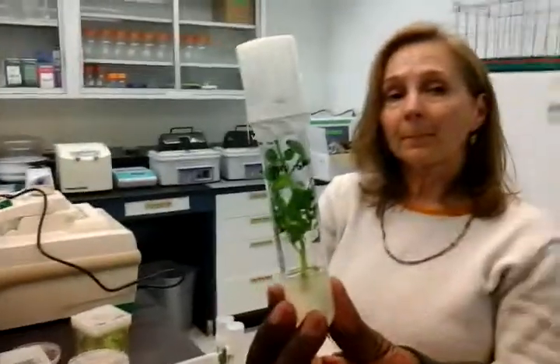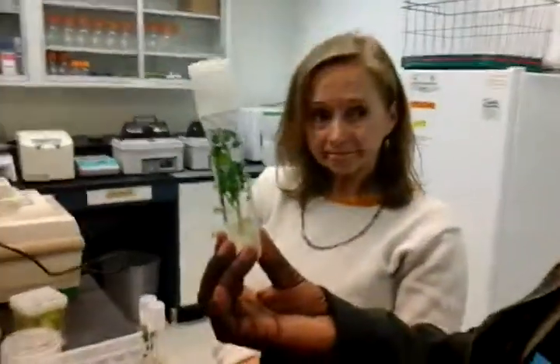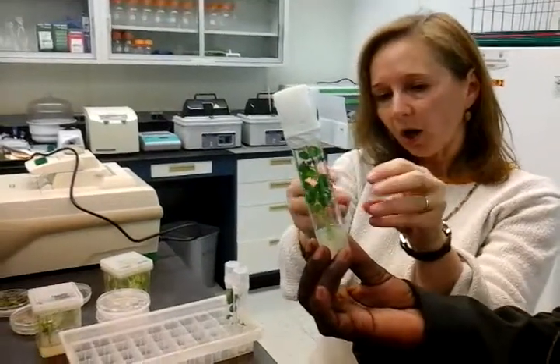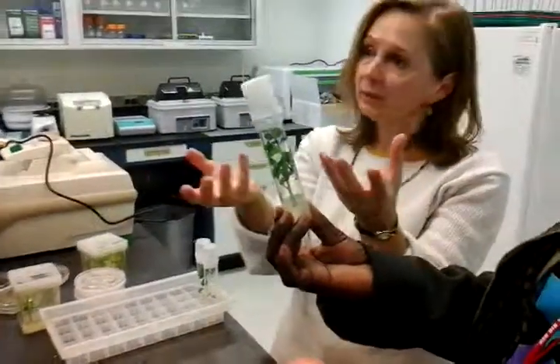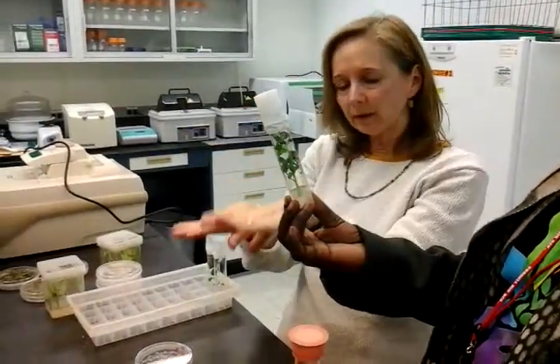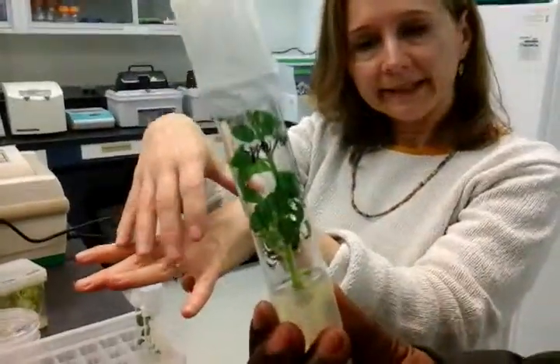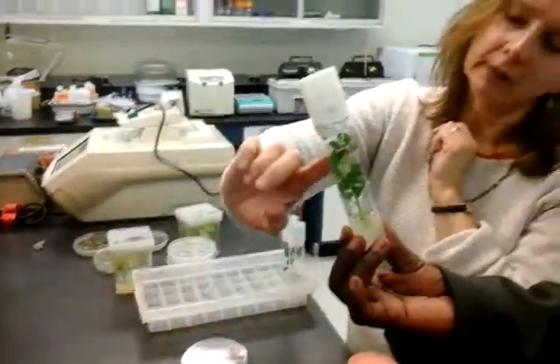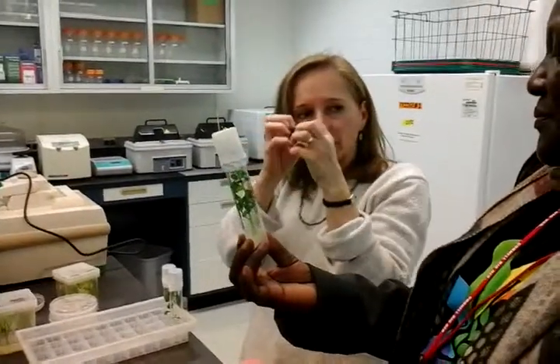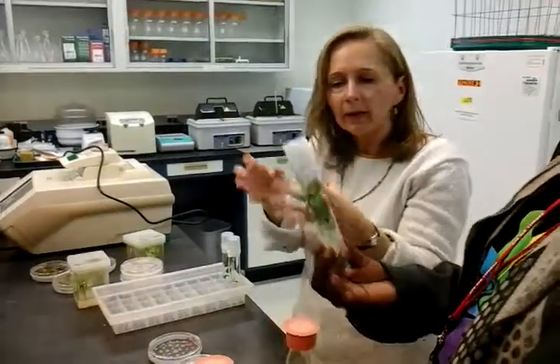Can you directly transfer the plant into soil? You could, and it would survive. What we do is take them out of the test tube, wash off all the medium because it has sugar in it — if we didn't, necrotizing fungi would grow. We wash that off, put it into soil, and then cover it. Look at all the humidity in there — the cuticle on the leaves doesn't develop well in vitro, and the stomates are open. If we just put them in soil uncovered, they would wilt.